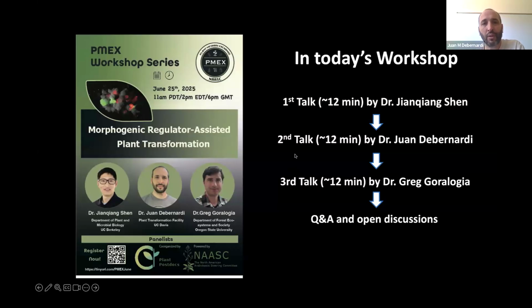So I prefer a faster protocol that induces embryos quickly, and those embryos can be chimeric, but most of the time what we are seeing, if you have a very efficient CRISPR tool, is that they will be biallelic, heterozygote, or even homozygote mutations.